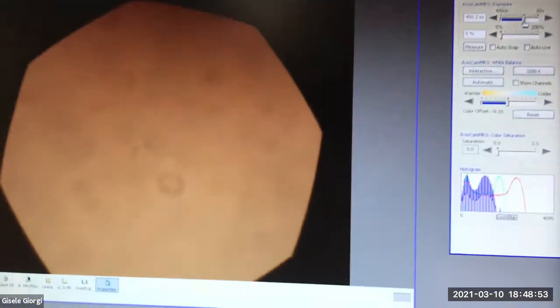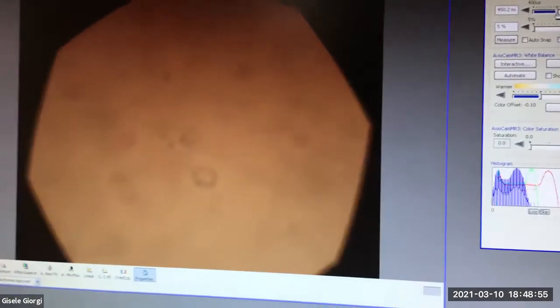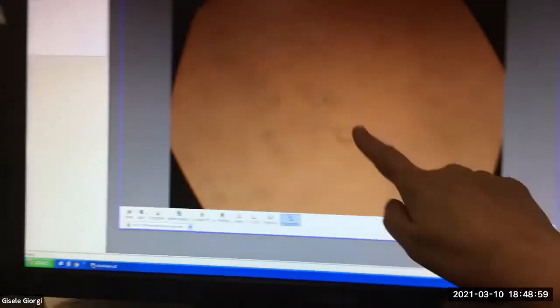And that's typical. You should be able to see that, oh, I can make it better now that I'm at a higher mag. So I'm going to make it a tiny bit better. And then usually it's focused. Look how nice and crisp it is now. Oh, so much better. Look at all that dirt in the scope. This is dirt in different places inside the scope. And now it is letting me go just past. This is where we want to open it, just past.